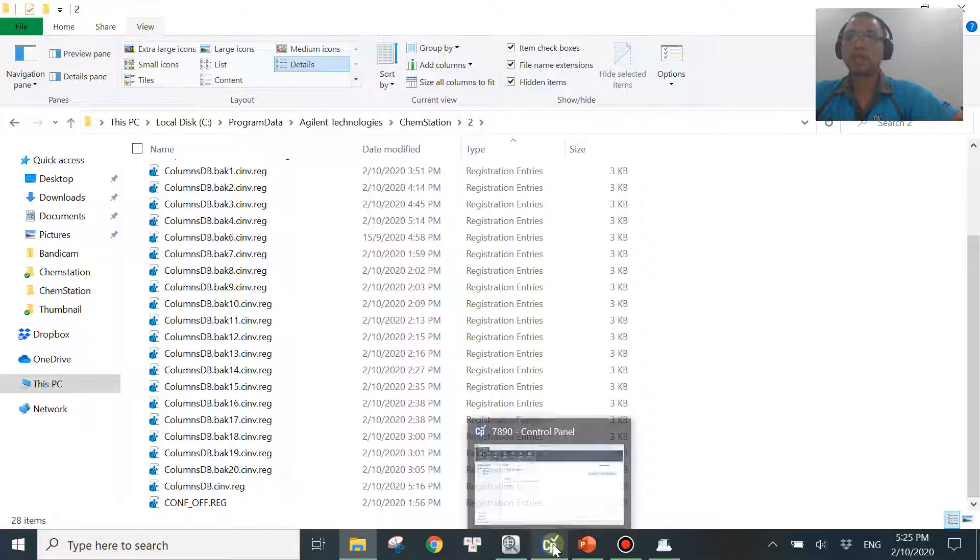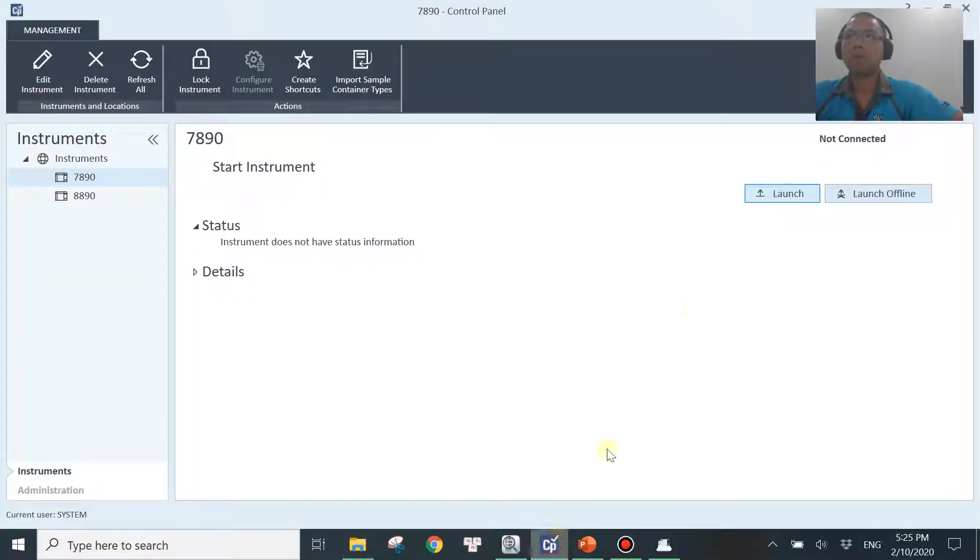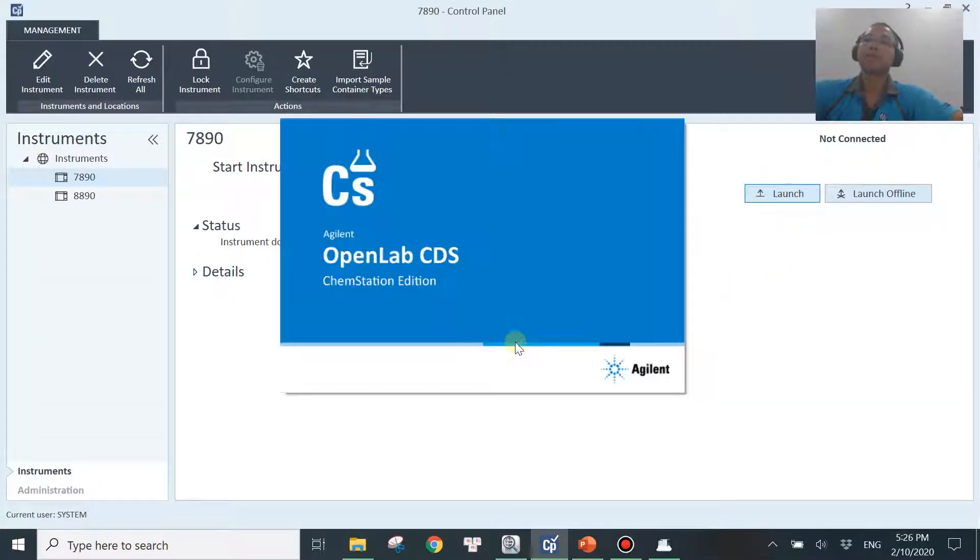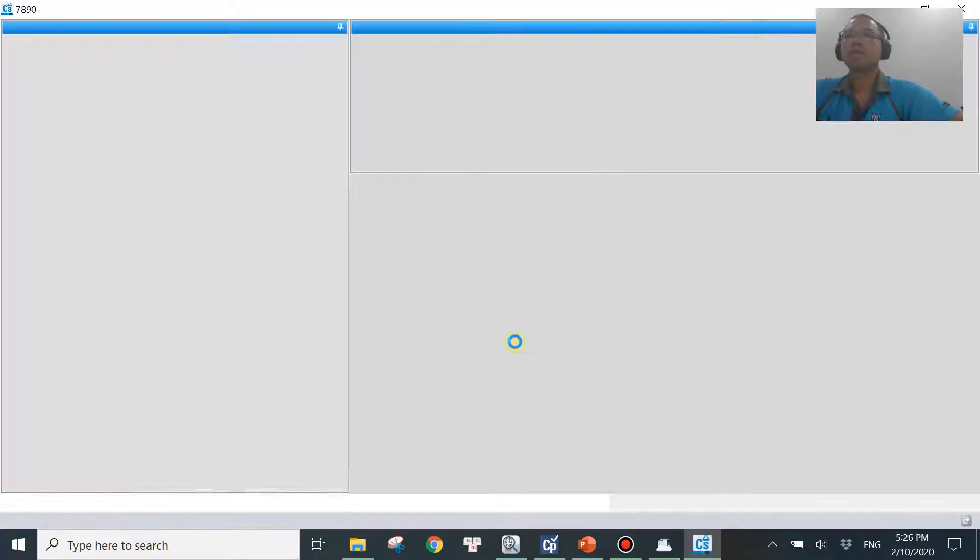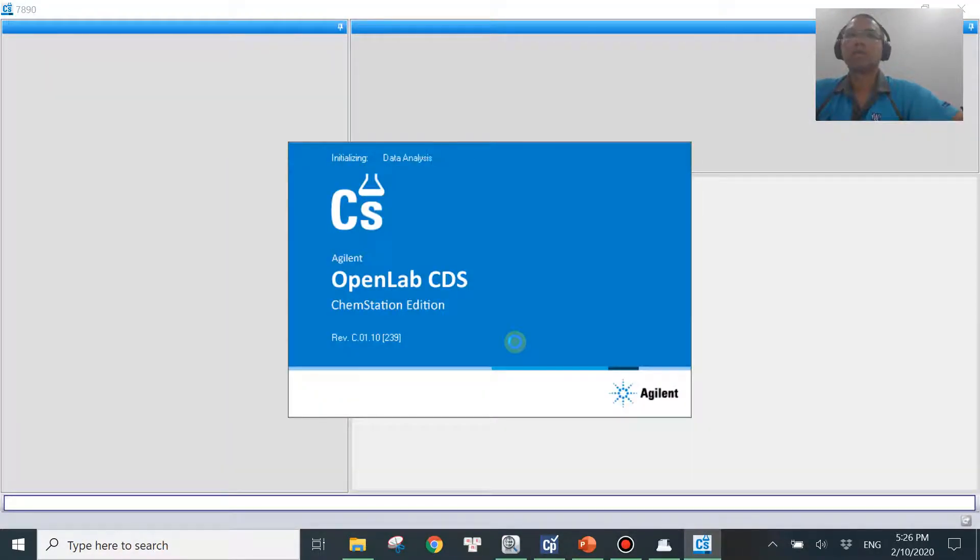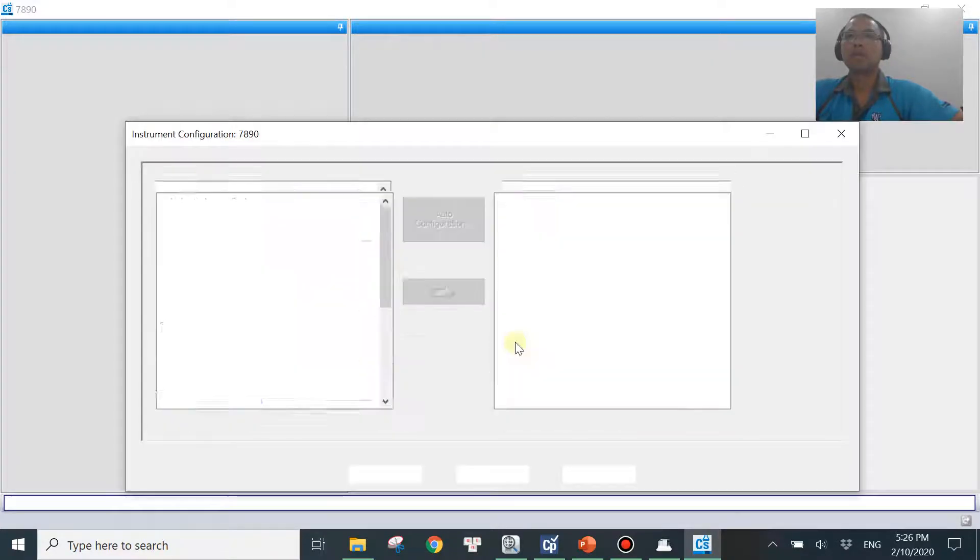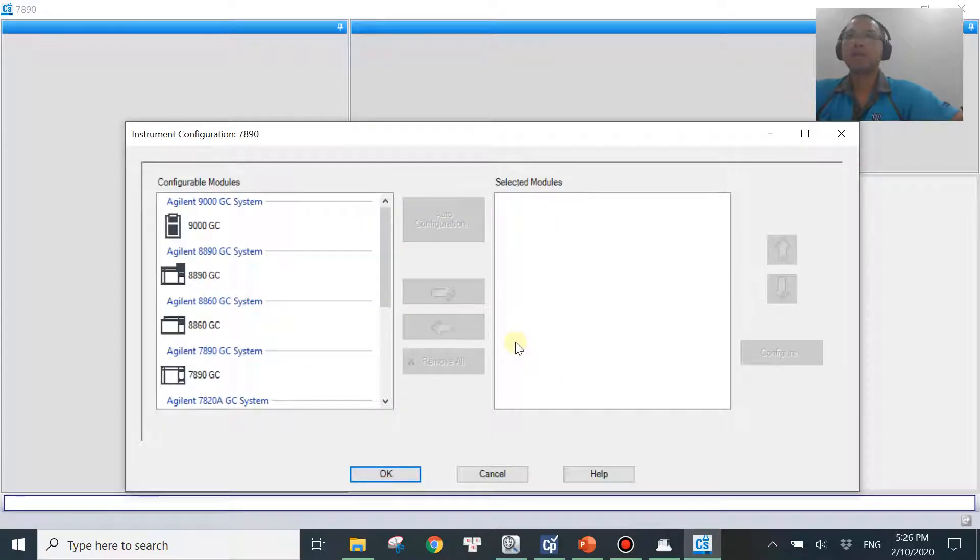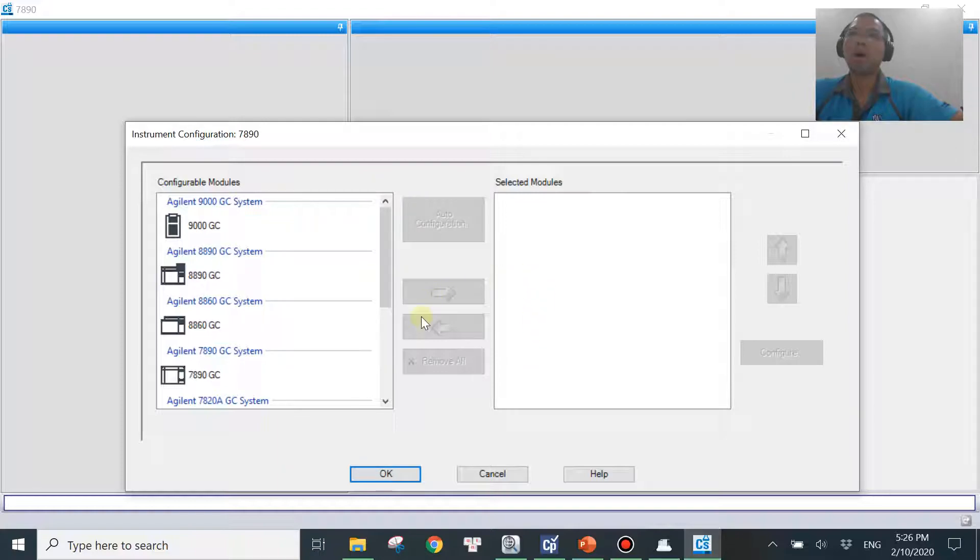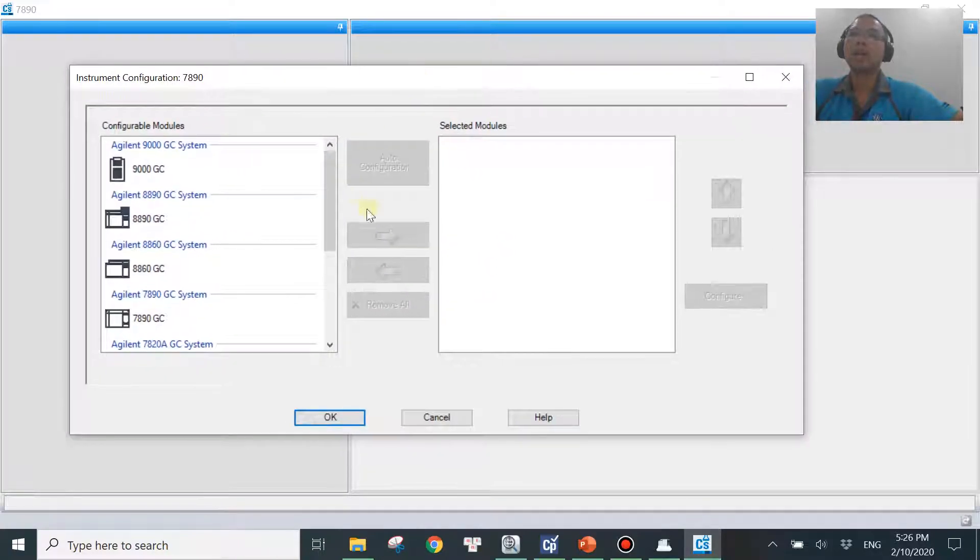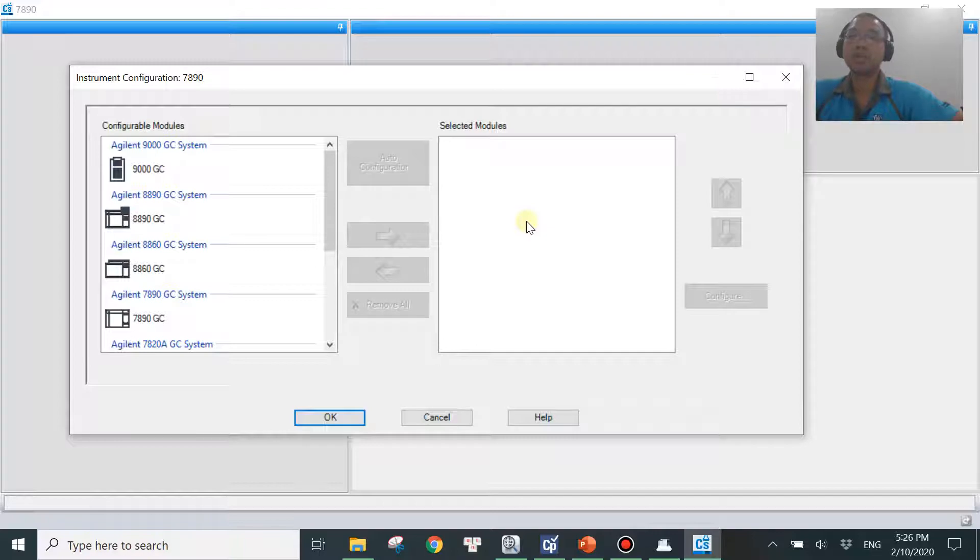So basically what that means is the software will not be using these four anymore. So now you can go back to your OpenLab control panel and you start launching your software. So what happened just now was we renamed the config file, all four of them. So that's why the software doesn't know which config to load anymore. So that's where it pops up a window for you to select the new configuration, the configuration of your GC, your instrument right now.